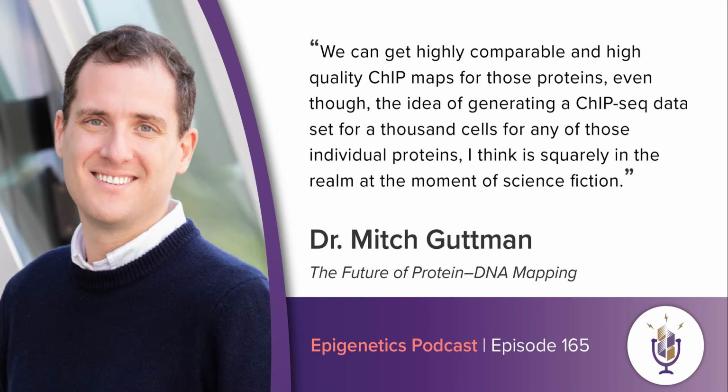In fact, going back to the traditional challenge around antibodies, the gold standard way to validate antibodies is often to use multiple orthogonal antibodies and identify concordance and consensus in their profiles. And this is just practically challenging, especially when you're doing things one by one, because it just explodes the numbers and the costs. But with a method like ChIP-dip, that begins to become a very practical approach to start thinking about validation and robustness.